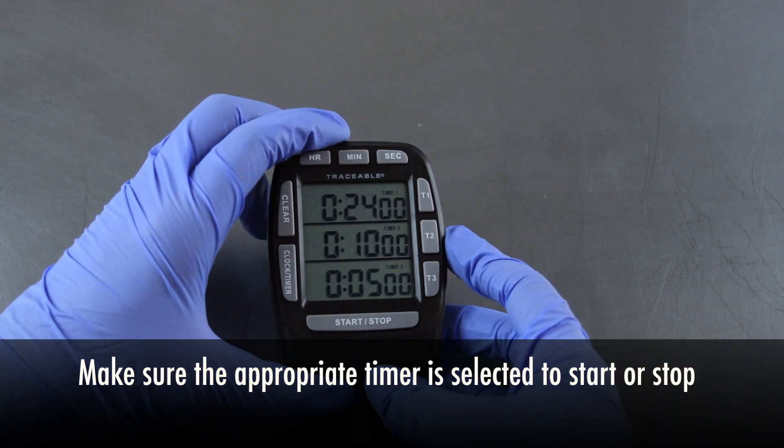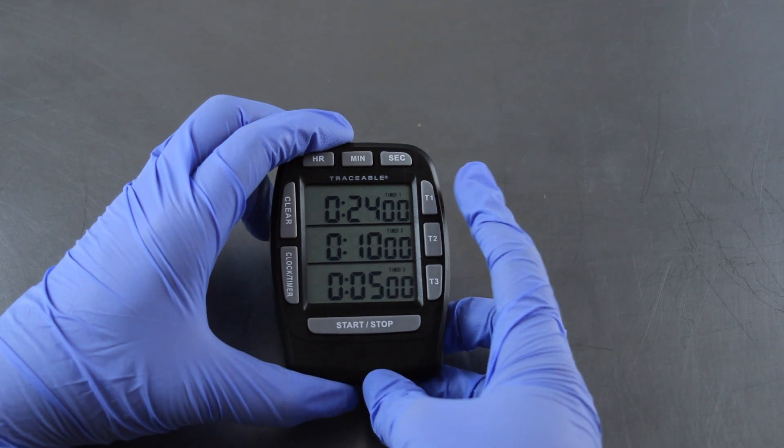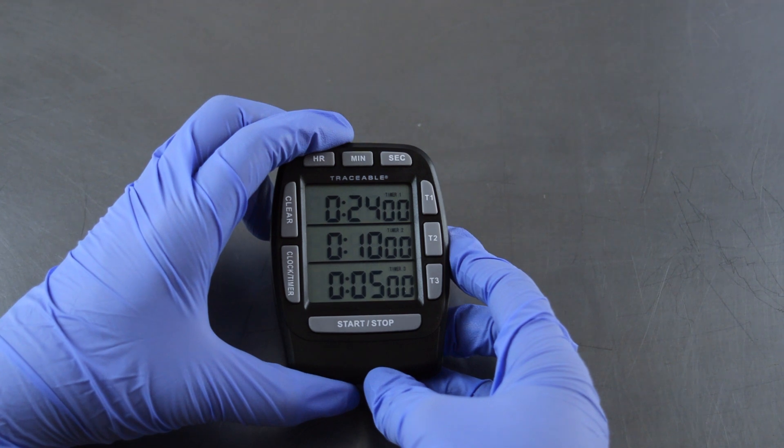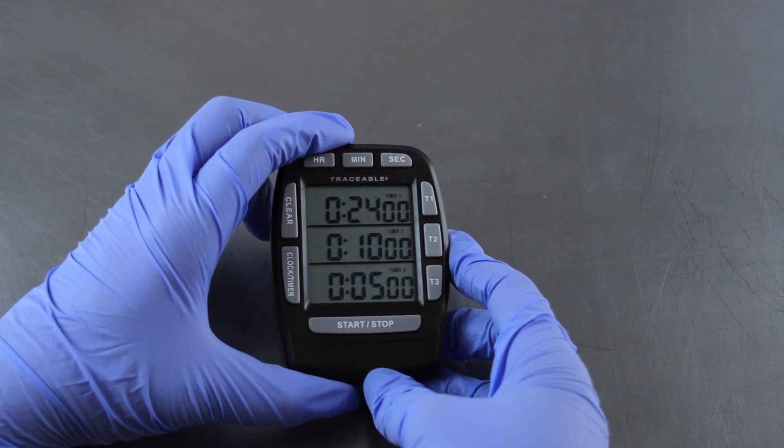Make sure the appropriate timer is selected when starting or stopping the timer. When sampling for particles, water, and oil, you can program all three timer channels before you start sampling.